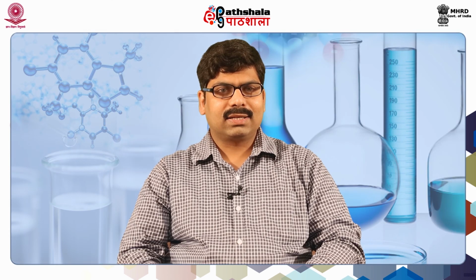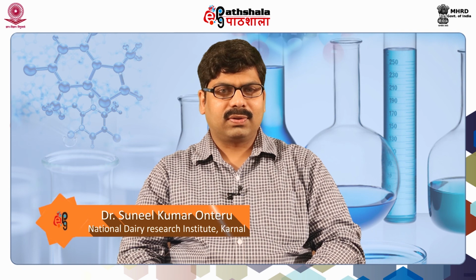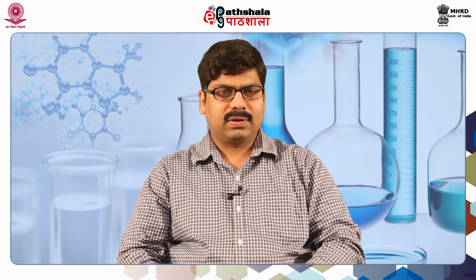Overall, in this lecture, we discussed the basic concept and principle of ion exchange chromatography, types of ion exchangers, choice of ion exchangers, the procedure of ion exchange chromatography, and the applications of ion exchange chromatography.